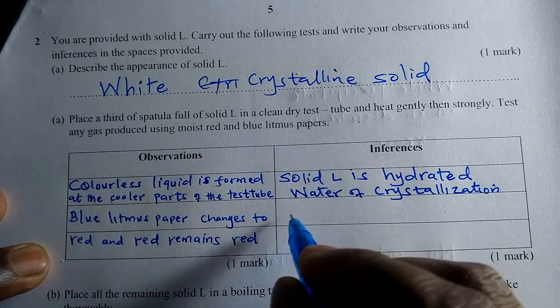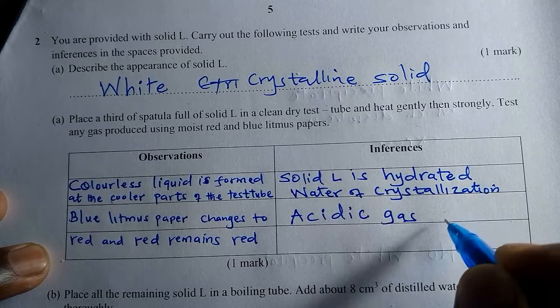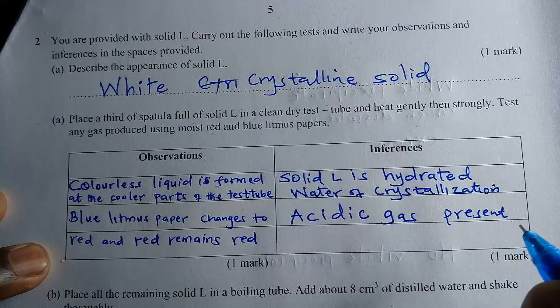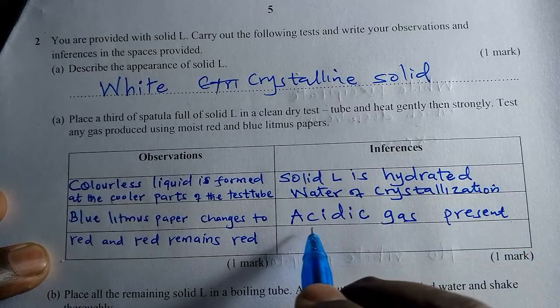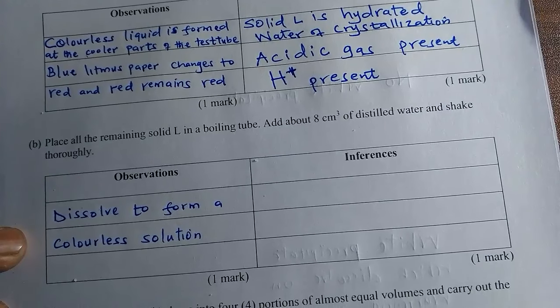Therefore, say acidic gas present. Or instead of writing acidic gas present, you can simply say hydrogen ions present. And that is all we need you to do.